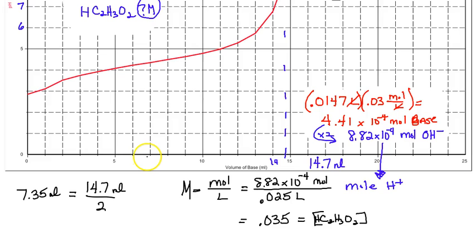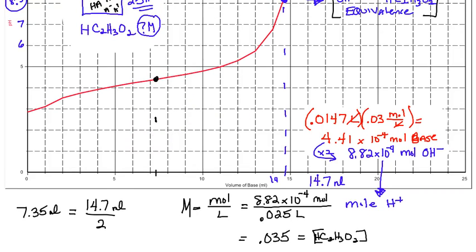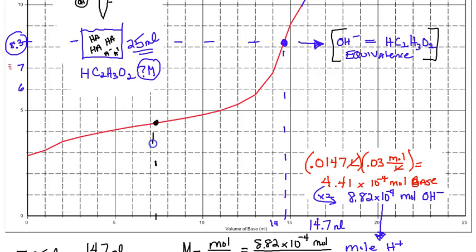Okay, so something like that. And if I go all the way up, that's something like that. Okay, so that's the half equivalence point, which is important. I'm gonna write it: half equivalence point. Some people would call this the max buffering region, but since we're staying away from equilibrium, I am not going to say max. We're gonna call this not max buffering, but we're gonna call this half equivalence. And that's really important to find.